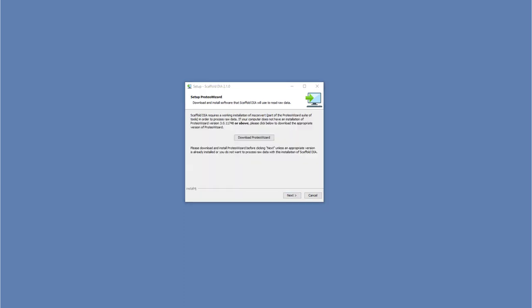DIA requires ProteoWizard 11748 or higher to be installed for the processing of vendor formatted RAW files. If you do not have ProteoWizard installed, Scaffold DIA will prompt you to download and install ProteoWizard from our website.